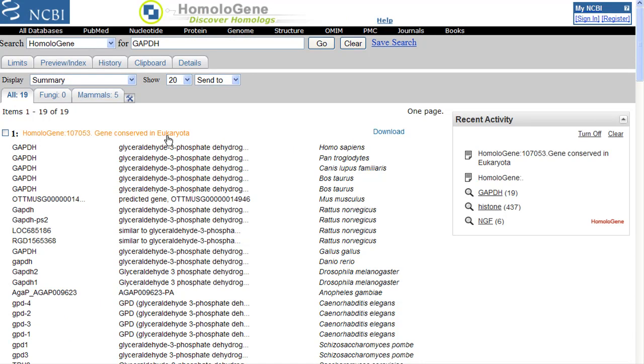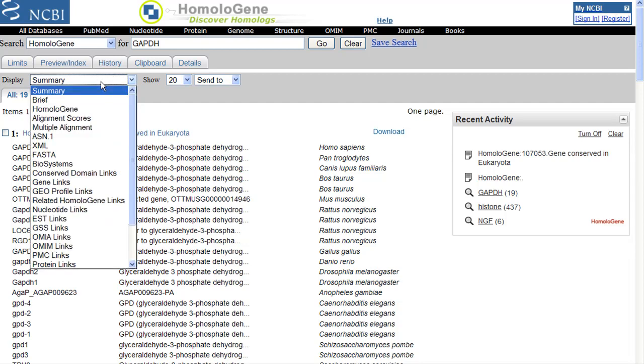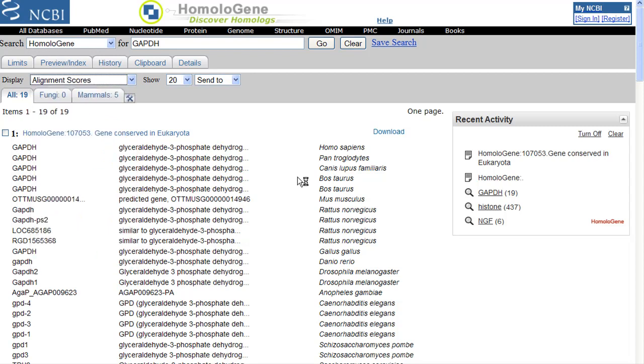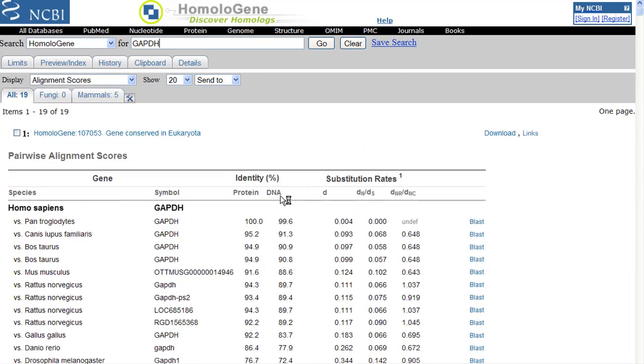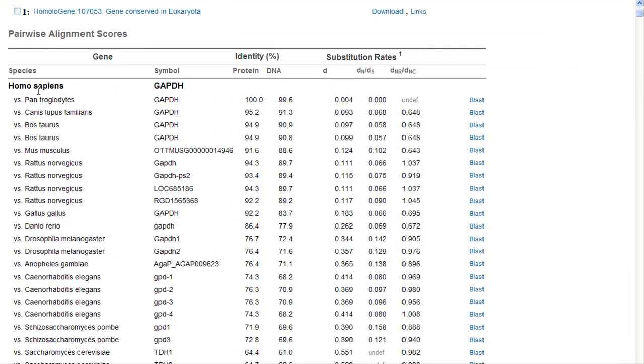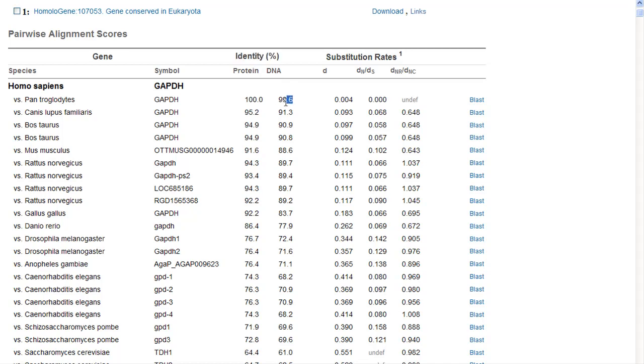There's lots of ways we can look at this data. For example, I'd like to show you the alignment score information. So here we are versus Homo sapiens. Here's the GAPDH homology, or rather identity, for the protein sequence and for the DNA sequence. So you can see chimp DNA is very slightly different from the human DNA, but the proteins are identical. That means that the mutation that occurred here didn't change the protein here.